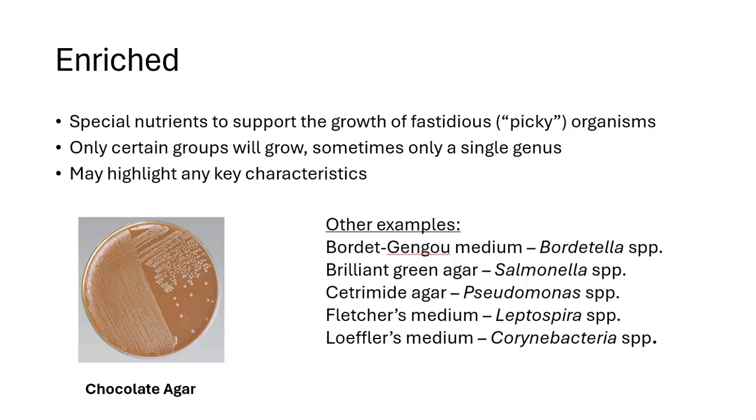Other examples are Bordet-Gengou media that's special for Bordetella species, brilliant green agar that grows Salmonella, cetrimide agar for Pseudomonas, Fletcher's medium, and Loeffler's medium. There are many, many other types of medium, each with often a very specific type of organism that they will grow.